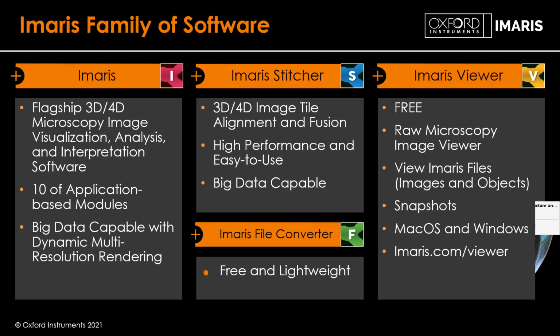First off, Imaris is a family of software. We have Imaris proper, which is our flagship, our original software that performs visualization, analysis, and interpretation for 3D and 4D microscopy images. We also work on 2D images, but we're definitely best known for our 3D image visualization and analysis.